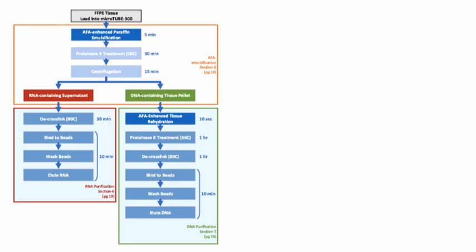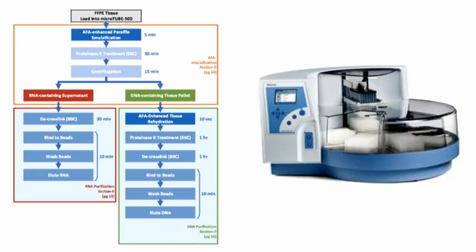And then the backside automation for this particular workflow is a Kingfisher. The really simple reason why is we keep the other robotics busy on more complicated protocols. The necessary steps here are actually pretty simple from a plate handling perspective, and this $50,000 or $60,000 robot fits that need really quite well. Easy to scale up and down, does a good job, and so that's how we've automated the backside of this, the bead handling step and the rest of the purification steps.